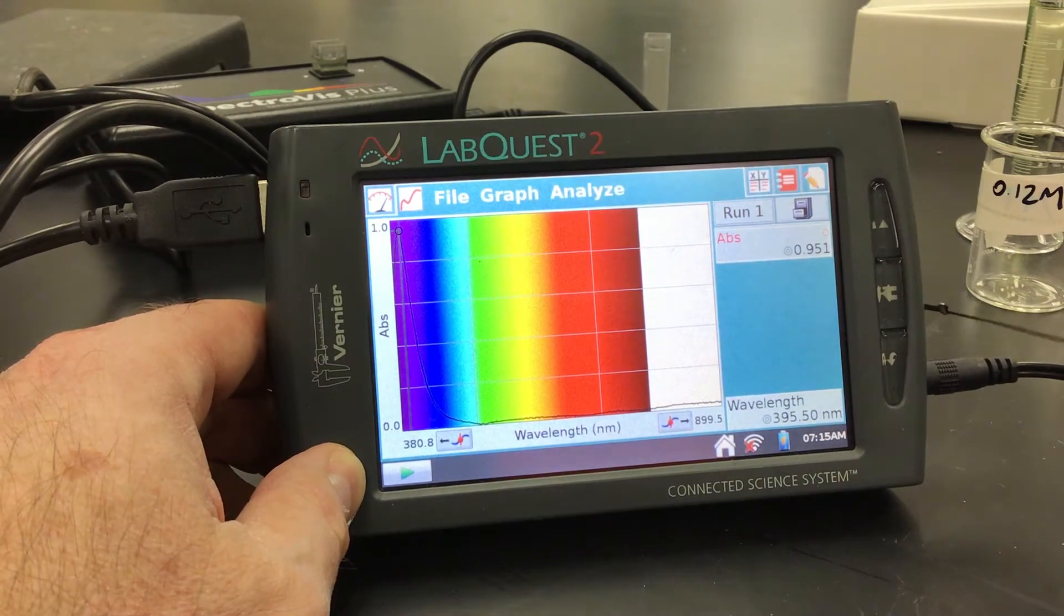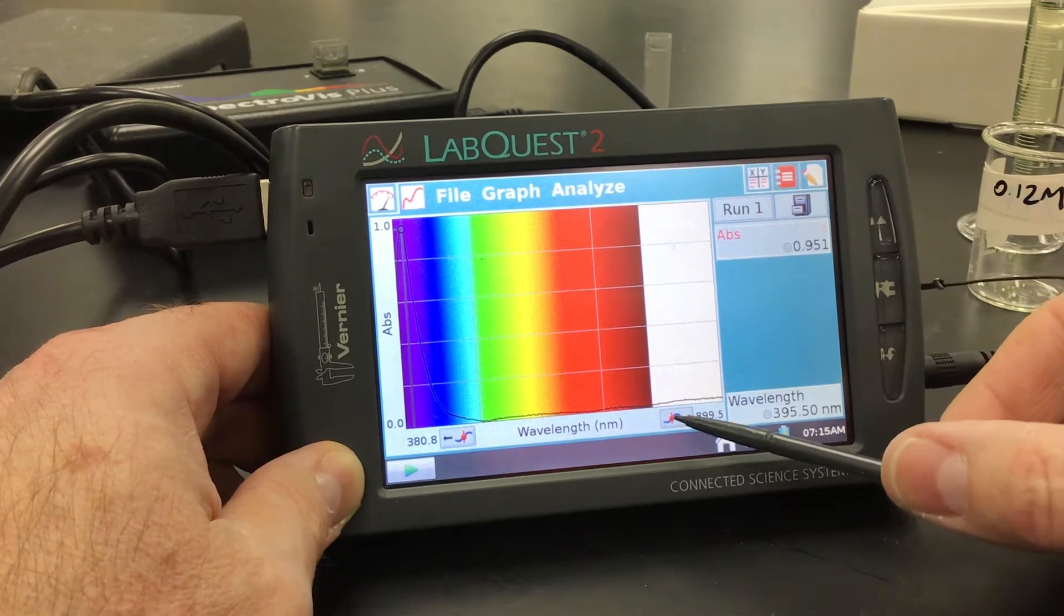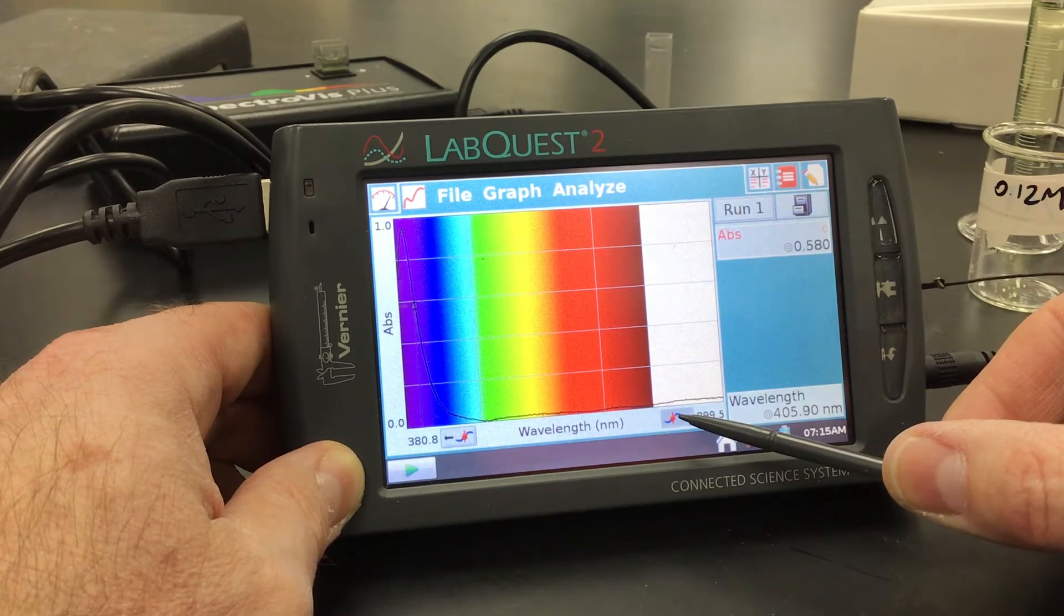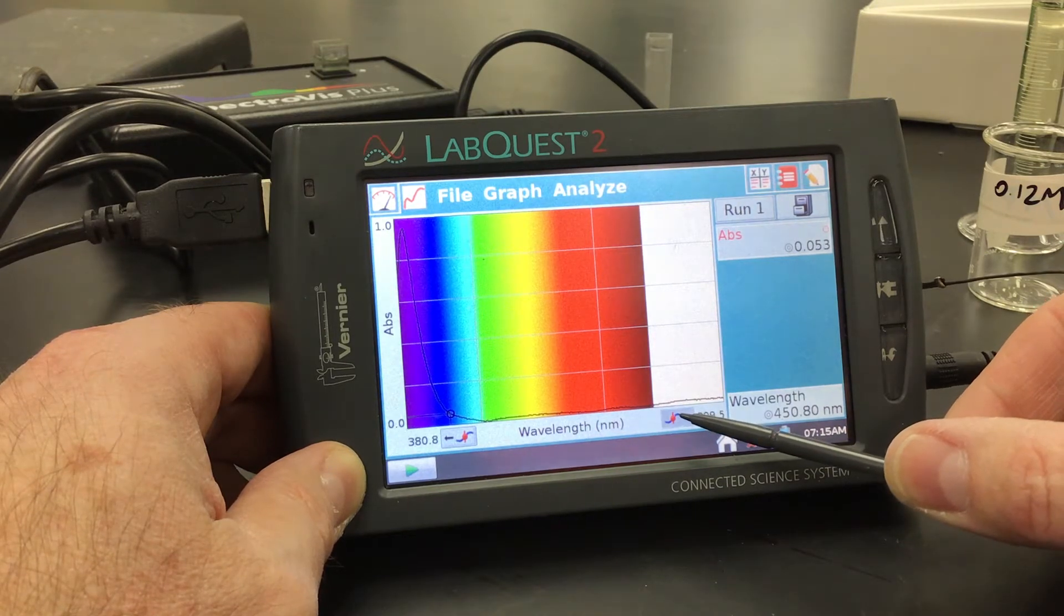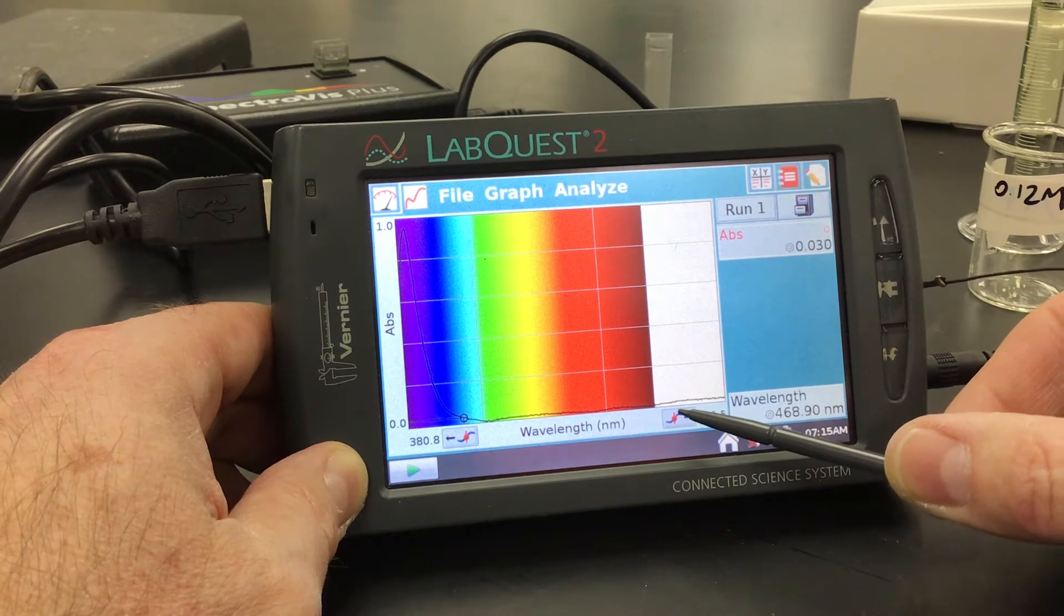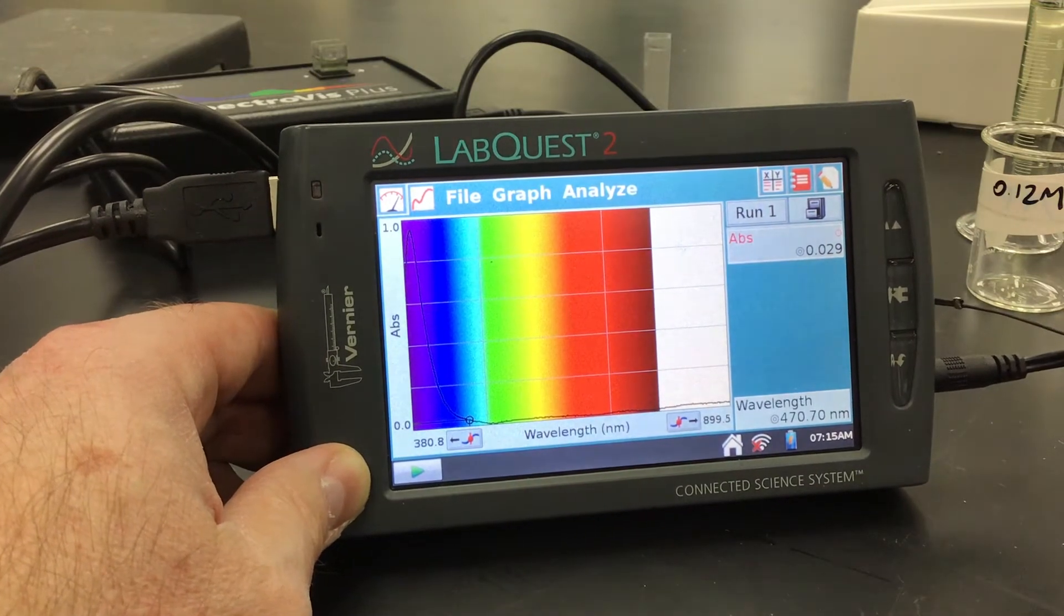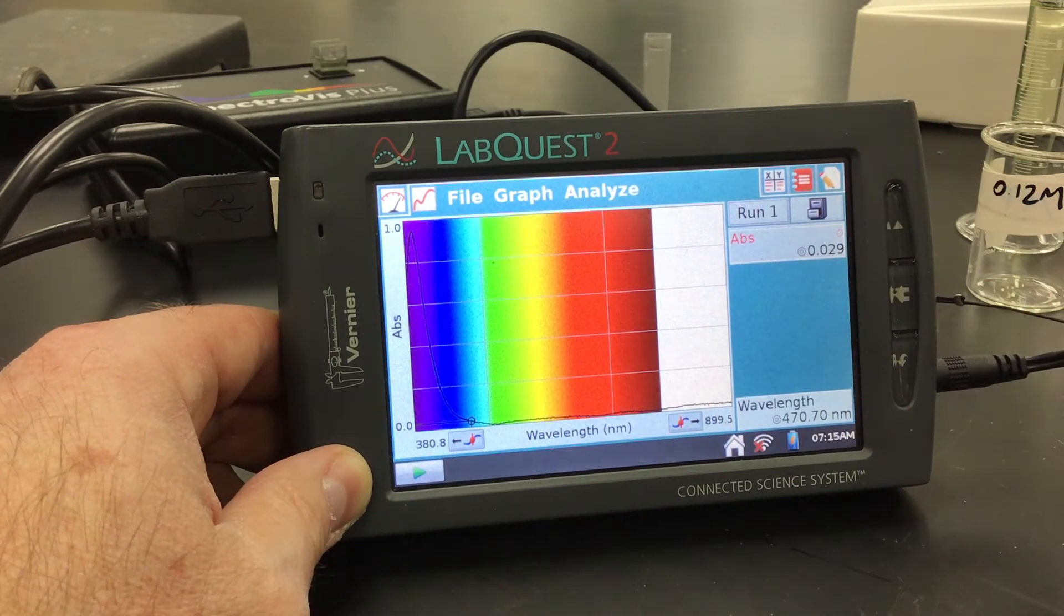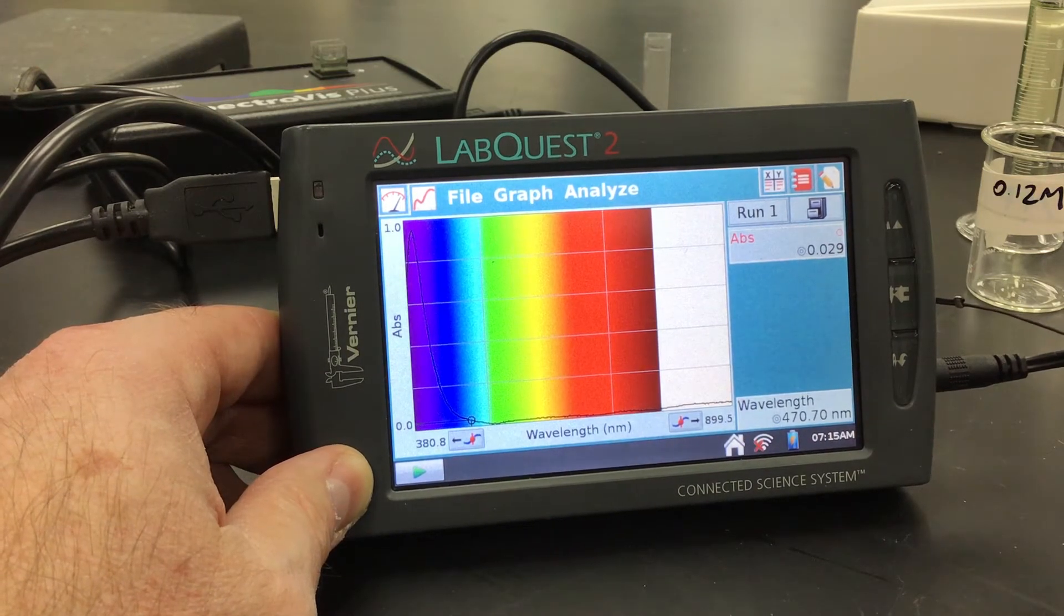Our wavelength where we're going to collect it at is going to be around 470. So I'm going to use my little toggle button to scroll over. If we didn't know this and we had to set the wavelength, we'd probably maybe do a dummy trial where we mix these together and we saw where the peak wavelength was absorbing. But our testing method says that's where we're going to be at.